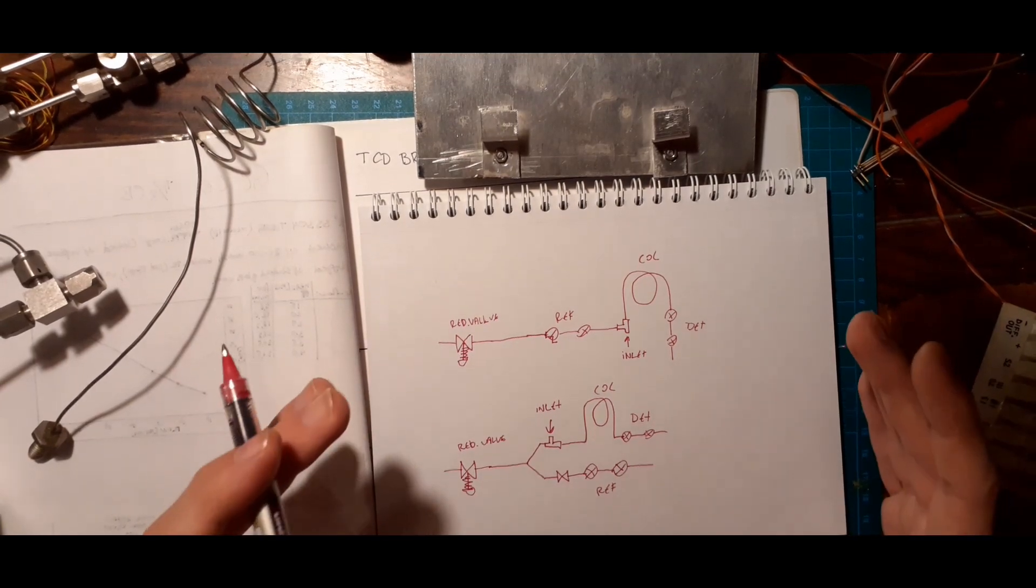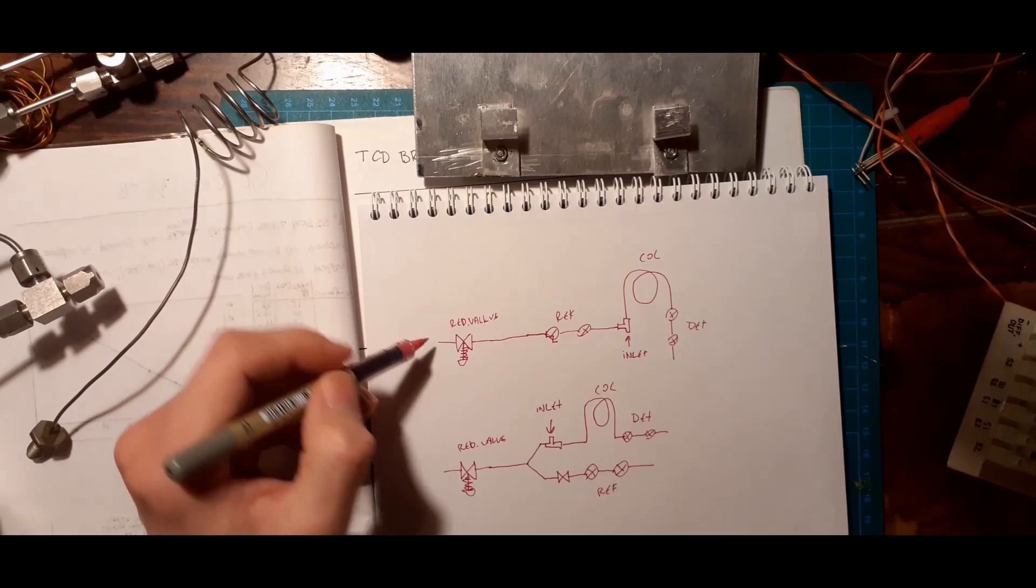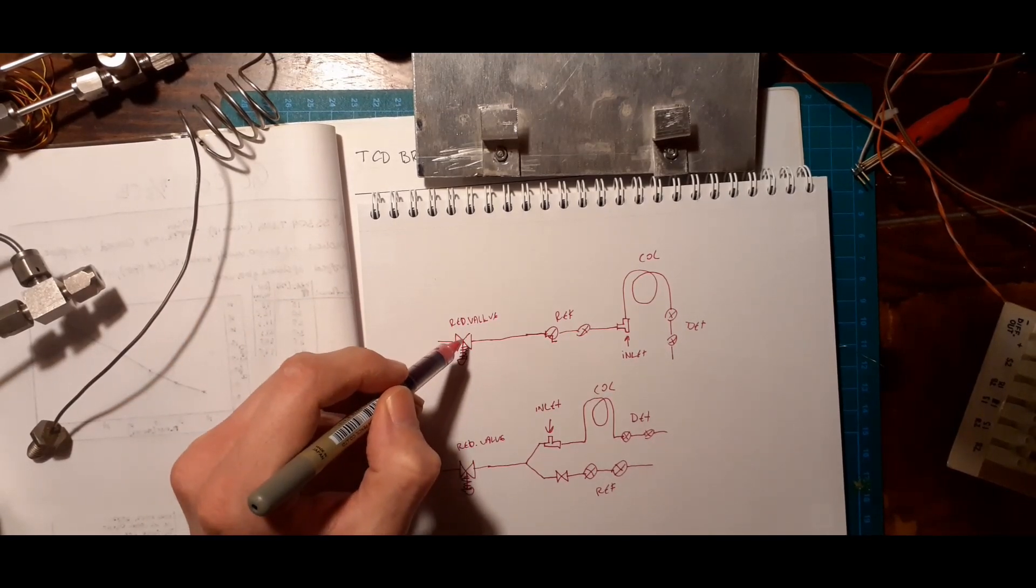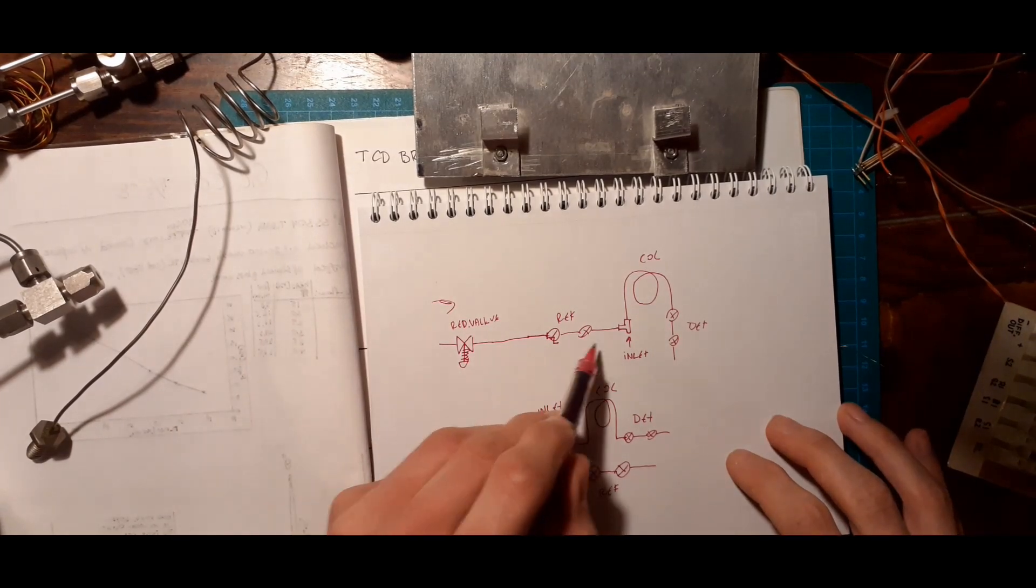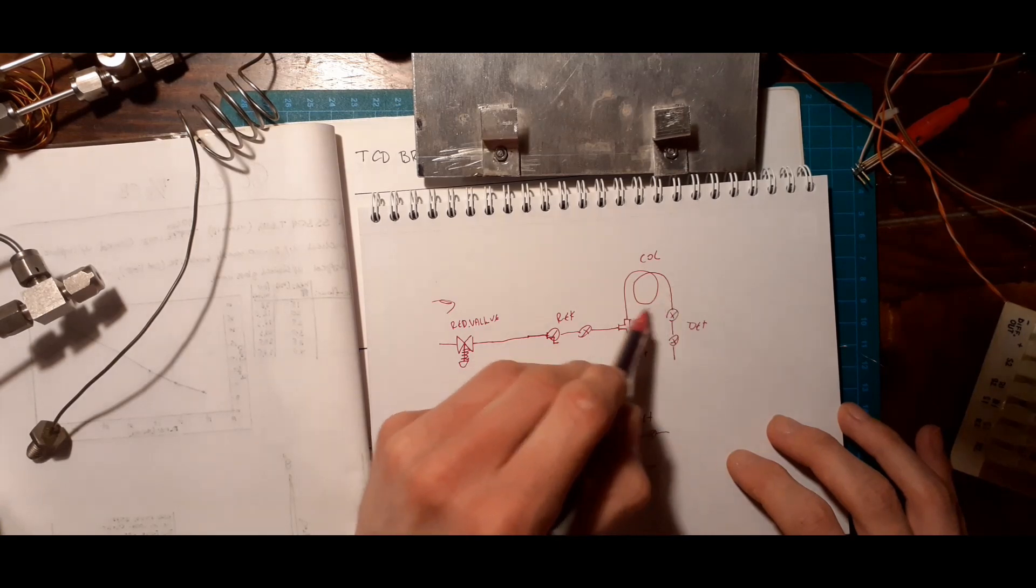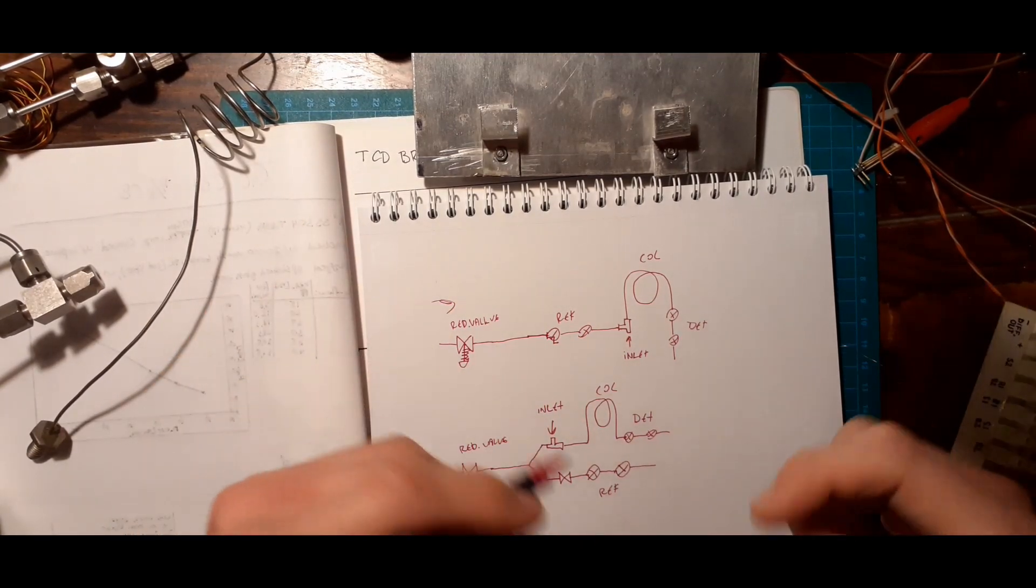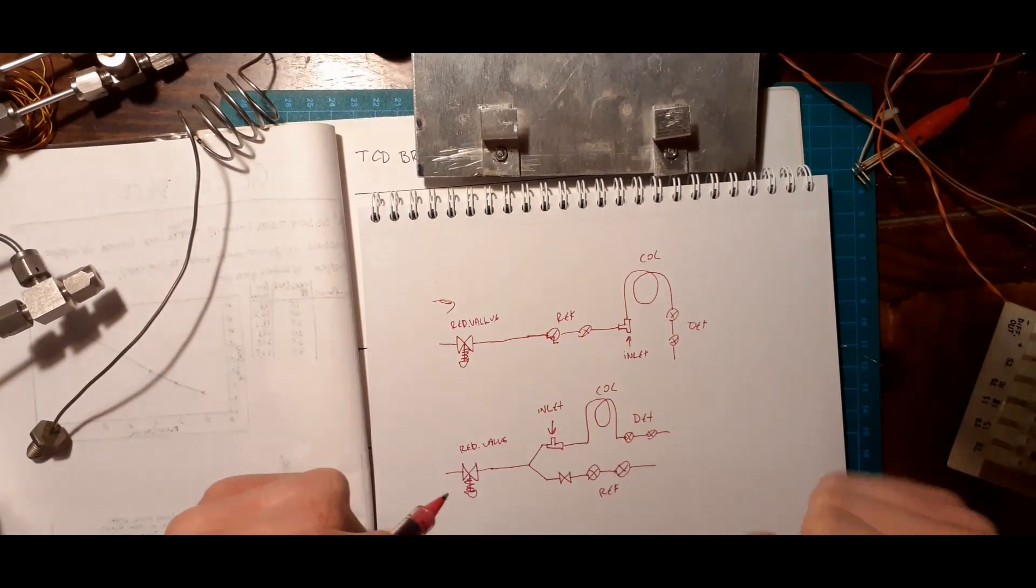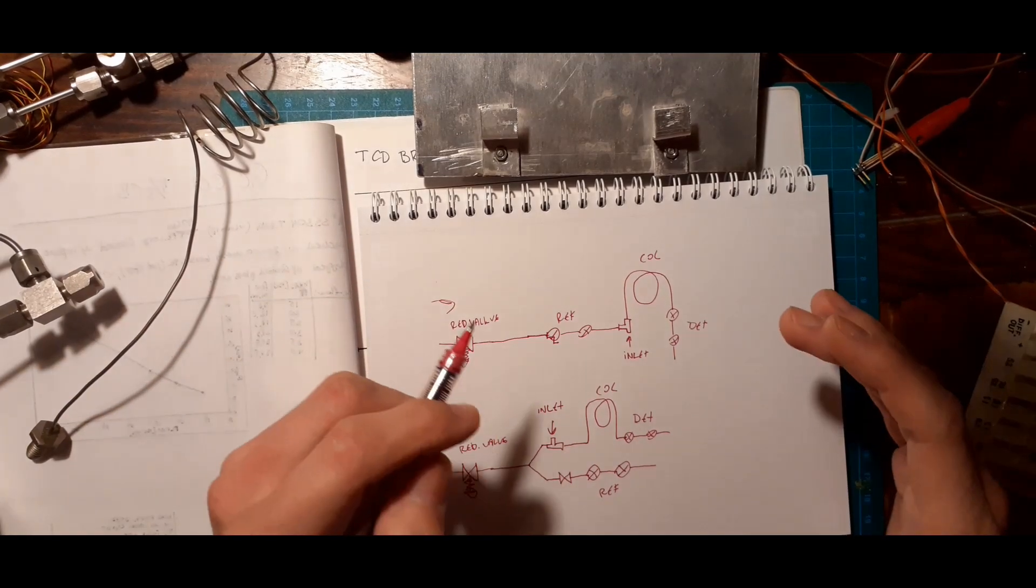Now there are basically two ways of implementing a thermal conductivity detector. That's the one I've done, where you have a reduction valve, or a pressure regulating valve from your tank, and then you have your reference side in series with that, you have your injector where you inject your sample, you have column, and you have the detector side on the other side. This is nice because you know you'll have the same mass flow through both. And I found that simpler.